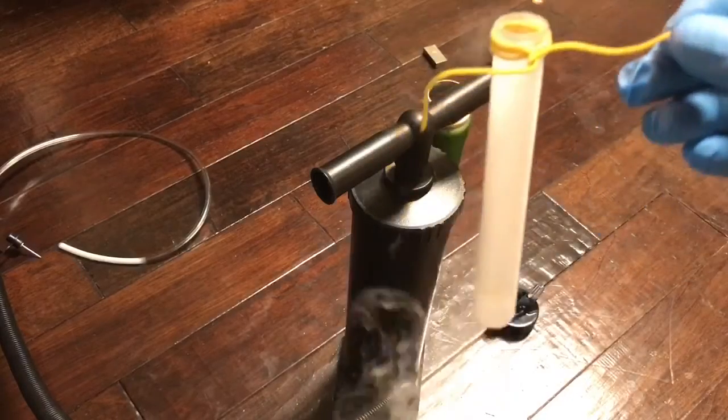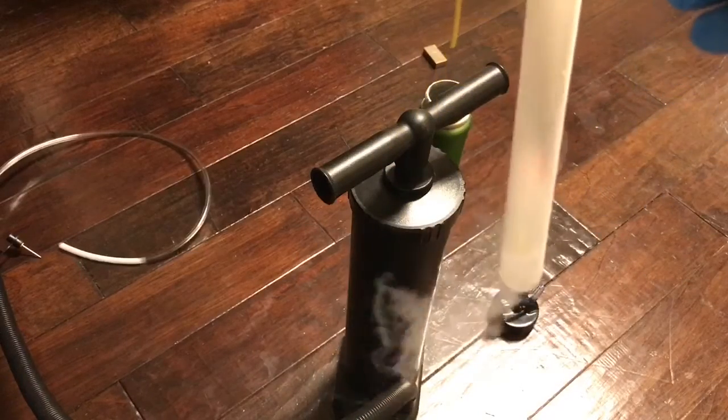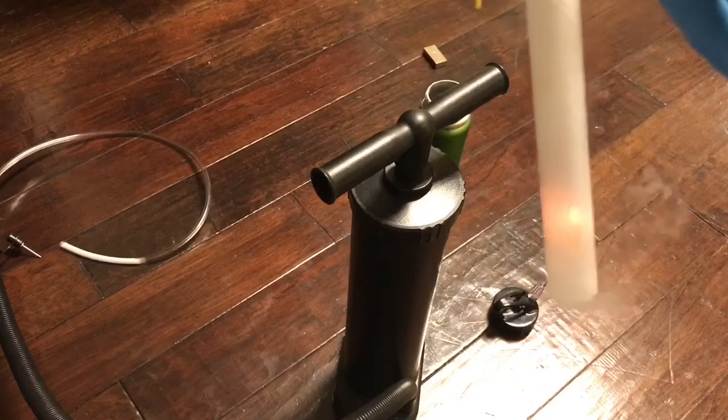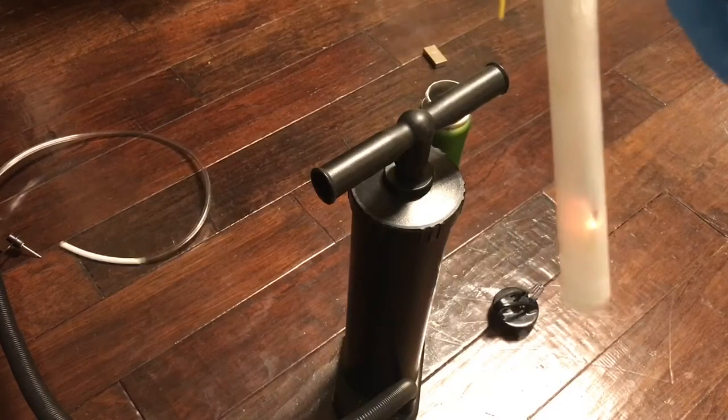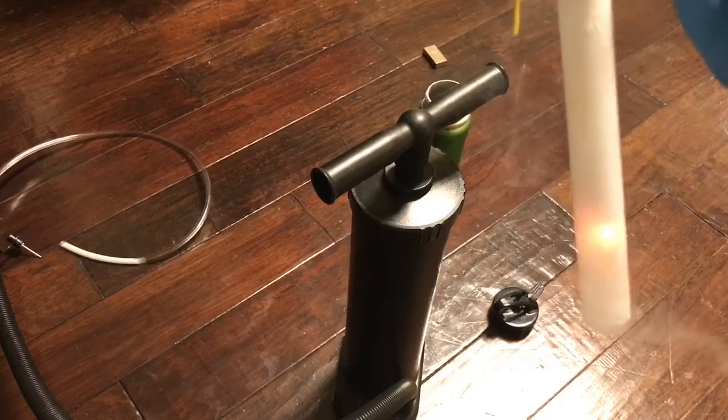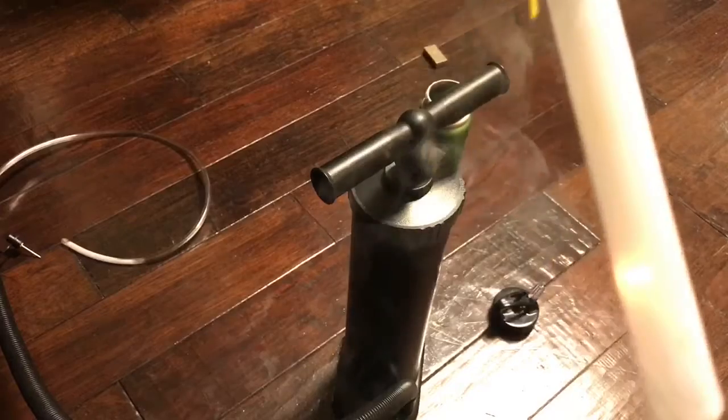Now we're going to see what a piece of burning wood does when put into the tube. It's getting converted completely to CO2 as it burns. Let's turn the lights down so you can see that better — there it goes, really brightening. It's burning intensely hot from the oxygen in the tube.